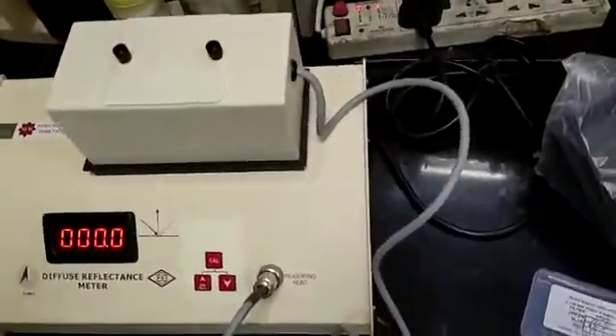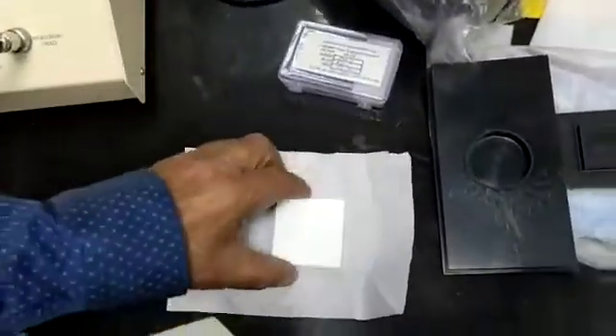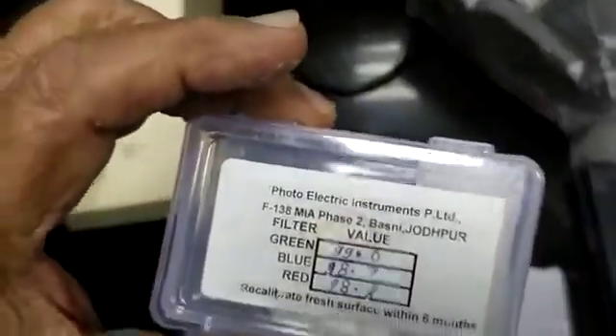Then place the head on the MG block. This is the calibrated MG block. The value is written on the box and a green filter is fitted inside the instrument. So the reading of the green filter is 99.